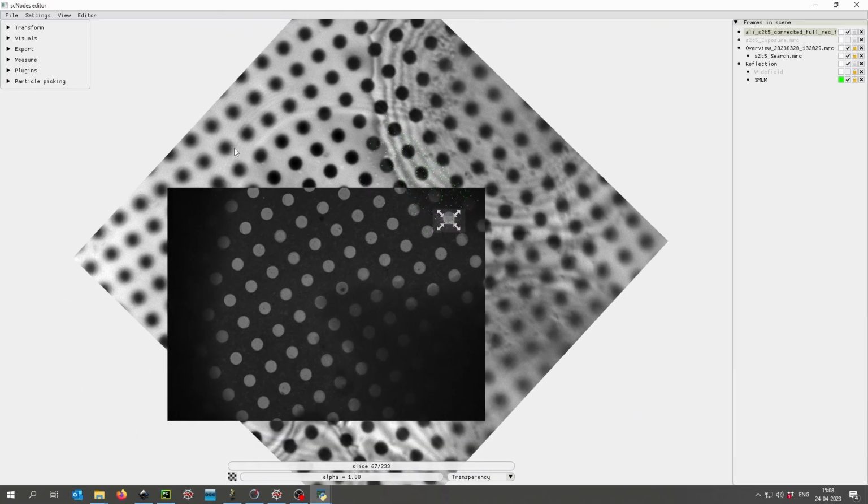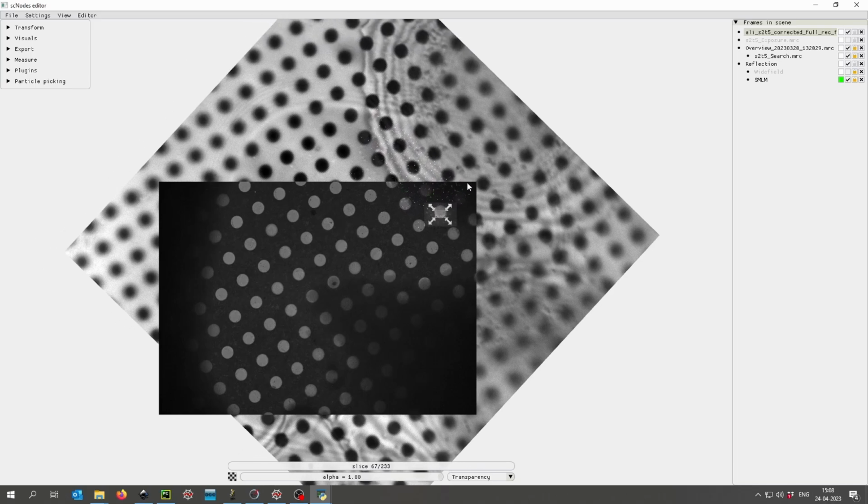So with that, let's get started with first the light microscopy data processing and then the EM data processing. We're actually loading it all into the correlation editor because we do the tomogram reconstruction in IMOD and EMAN, and see how to set up a scene like this.